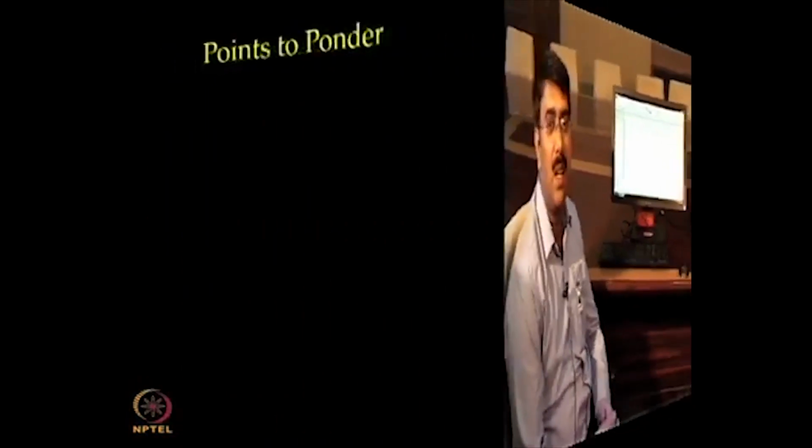Now we have successfully demonstrated the protein-protein interaction here, with protein A and the mouse monoclonal antibodies we used, and we got very good data with the 1:1 binding model, with the affinity around the 1.7 nanomolar range. So with this I am concluding my demonstration.